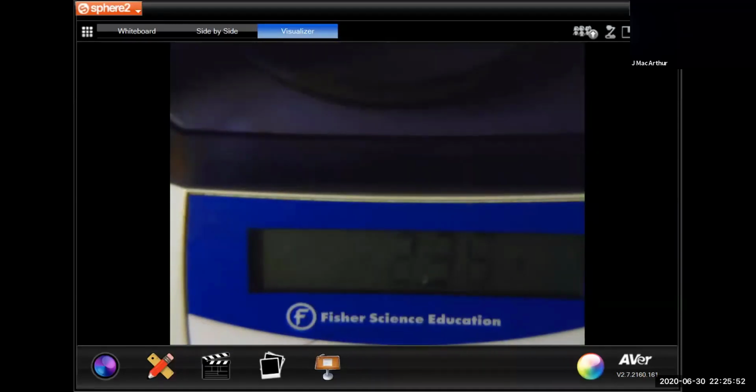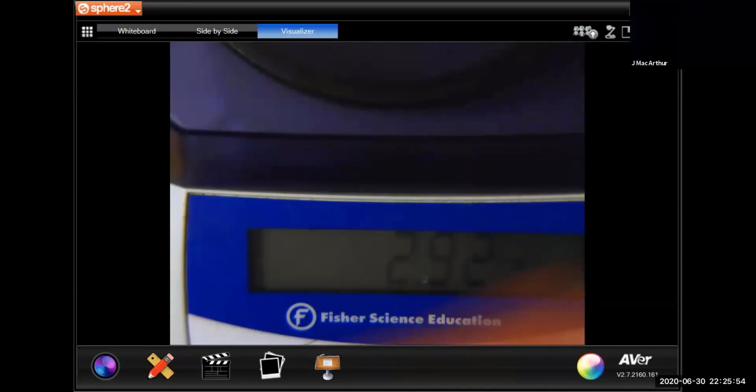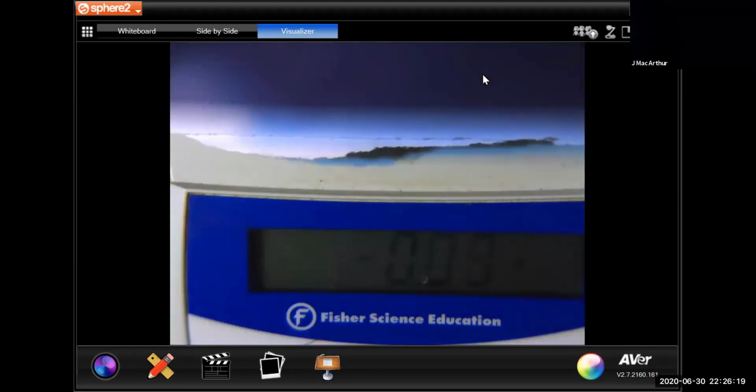We have our balance here again. Let me check on the chat before we. So it looks like you're back. So I think what we can do is when we go to groups, I'll make sure everyone's in the right spot. And then if we need to go back and remeasure something with someone, we can.